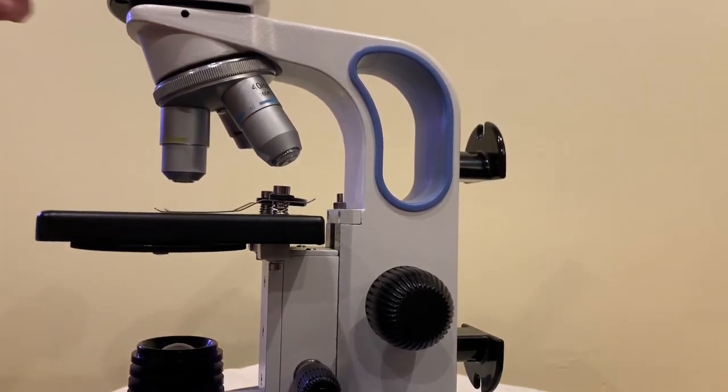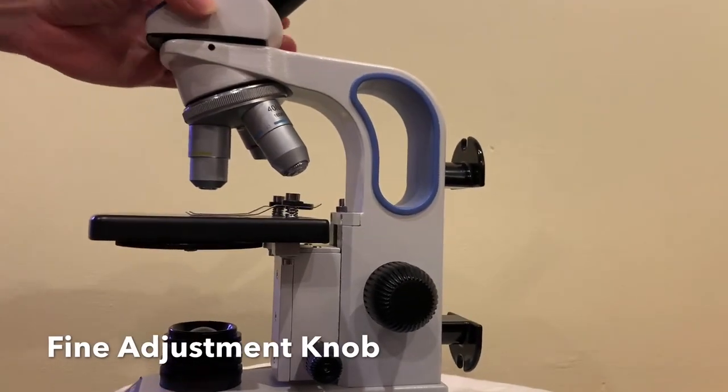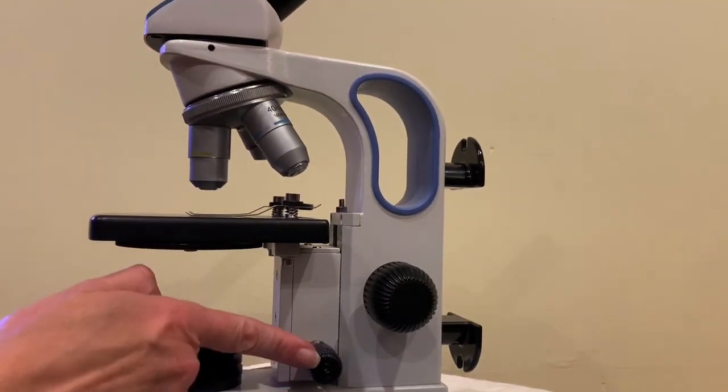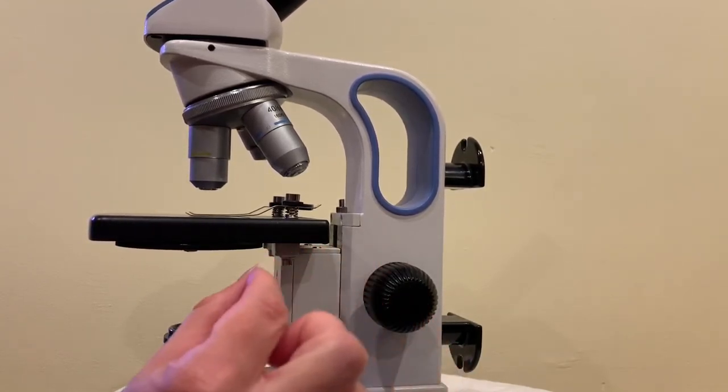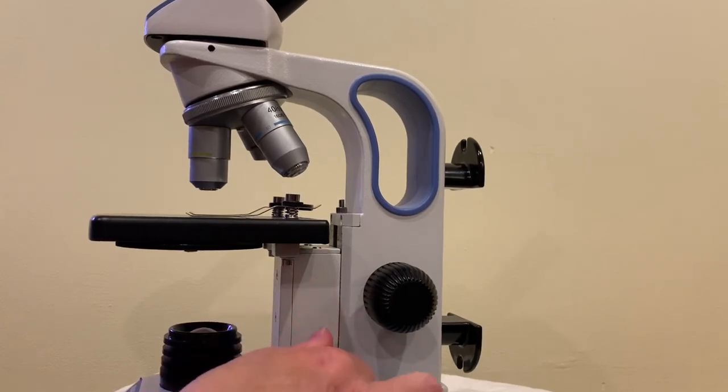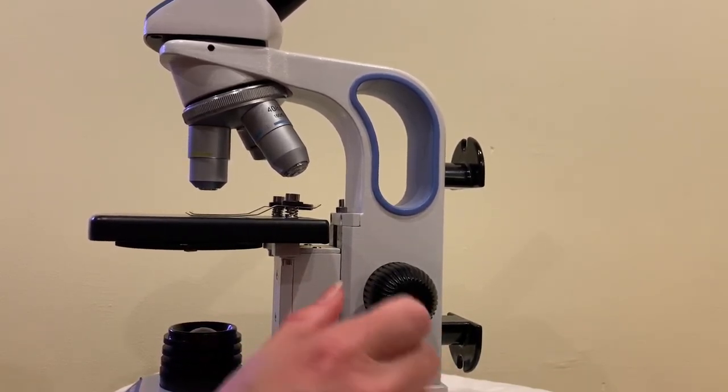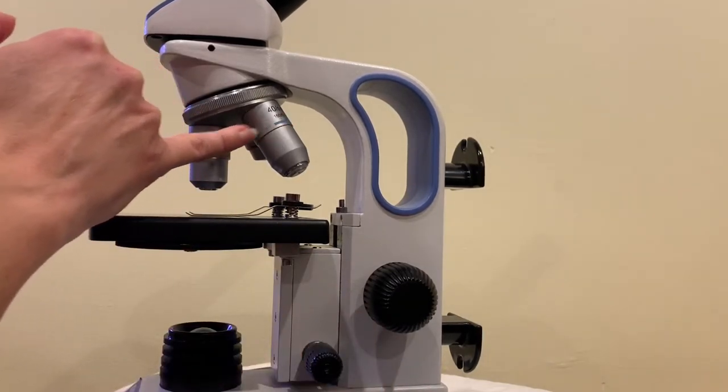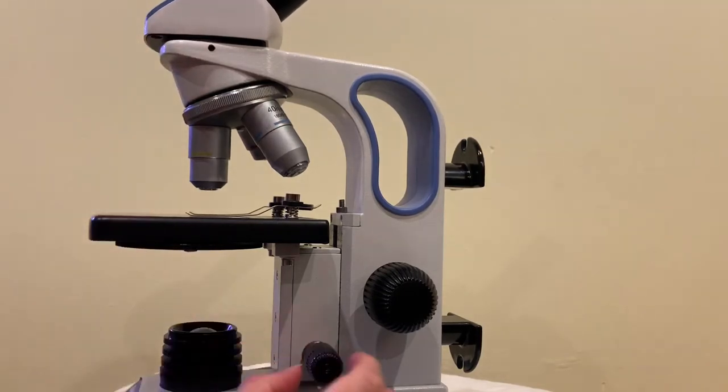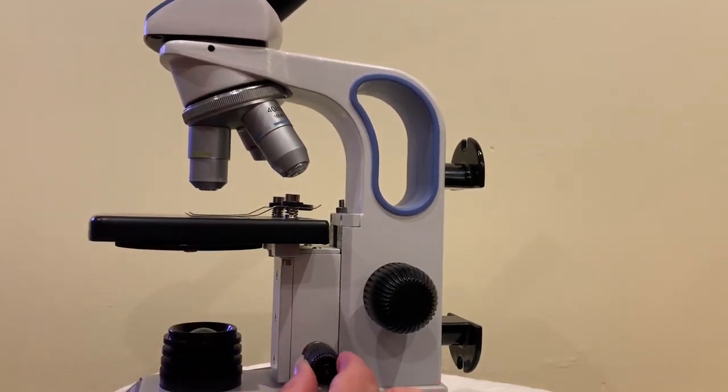From this point forward we're only going to use the fine focus knob. So now when I turn the fine focus knob what do you notice happening to the stage? Nothing really right? It's moving the stage up and down but very in small amounts. So we use the fine focus knob when we're using the larger magnifications because the fine focus knob fine tunes the focus.